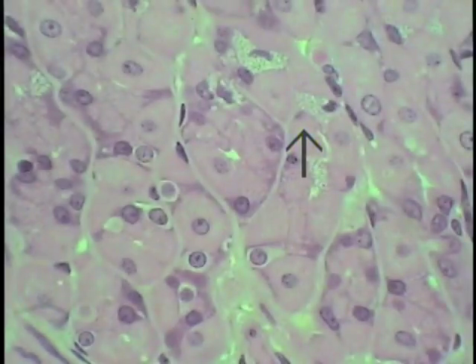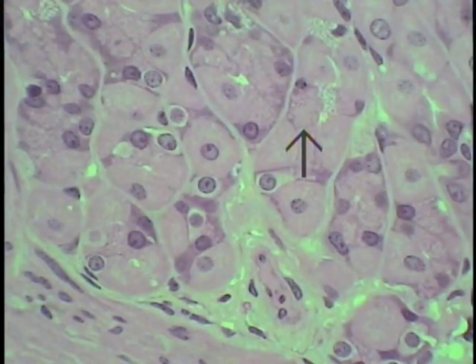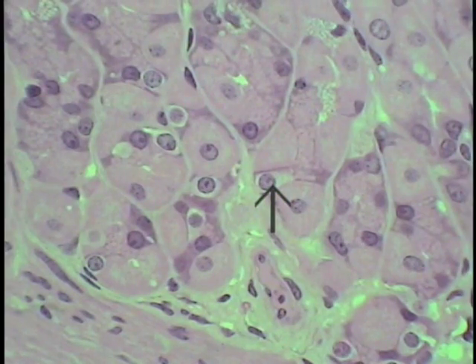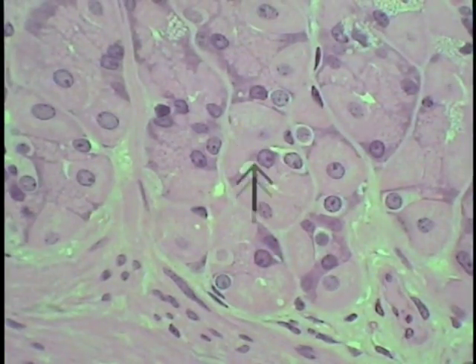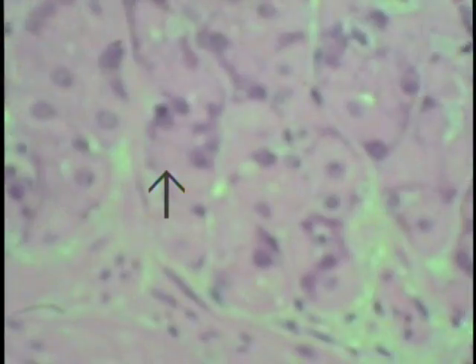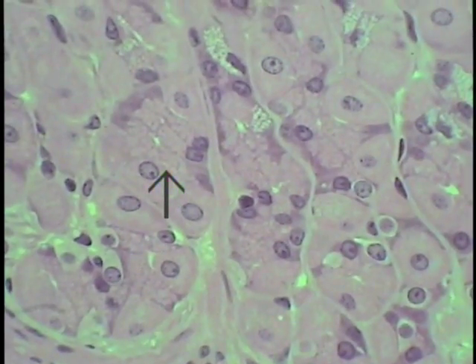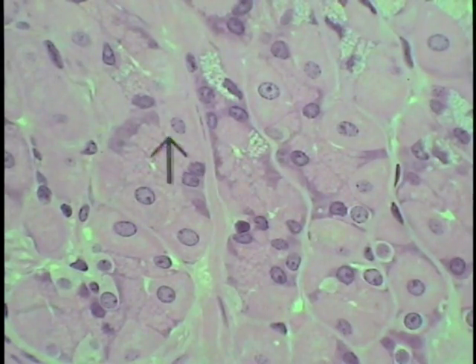And one can see in this particular region of the stomach, they are in abundance, as indicated by the pointer. All of these oval, round, egg-shaped type cells. A chief, or a pepsinogen-secreting cell, is shown here. Another one is shown here, where the zymogen granules are quite well delineated. Here's another example of some of these cells, the chief or pepsinogen type cells.